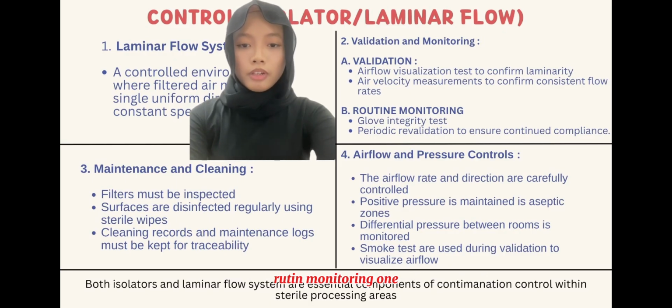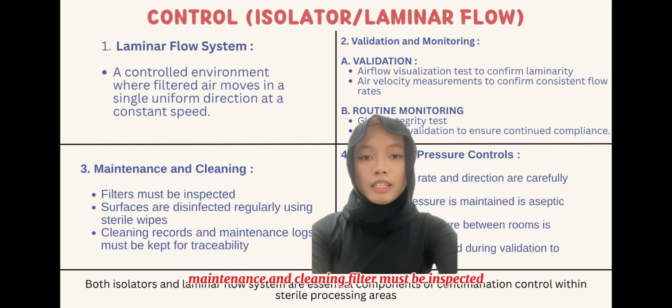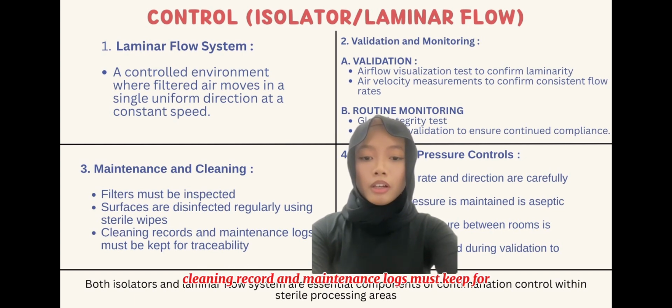B. Routine monitoring. 1. Glove integrity test. 2. Periodic validation to ensure continued compliance. 3. Maintenance and cleaning. Filters must be inspected. Surfaces are disinfected regularly using sterilized wipes. Cleaning records and maintenance logs must be kept for traceability.